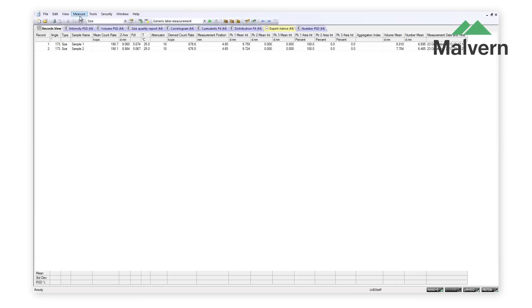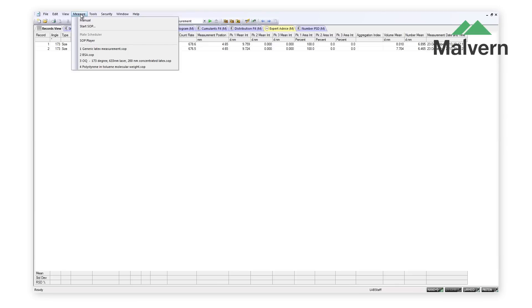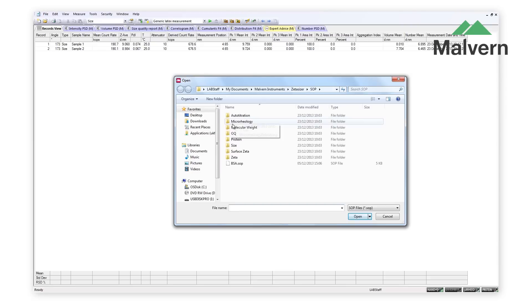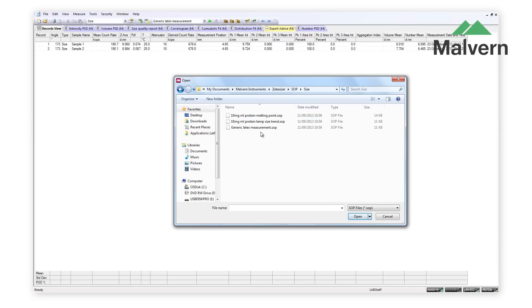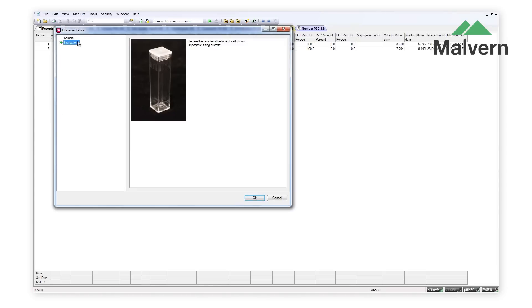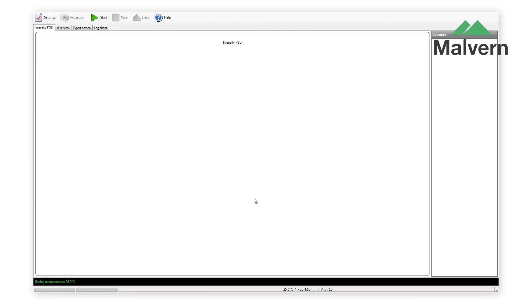Sample measurements on the ZetaSizer Nano are simple and can be started after only two clicks of the mouse. Standard operating procedures are provided in the software, which preset all of the measurement conditions and also show you which measurement cell to use.